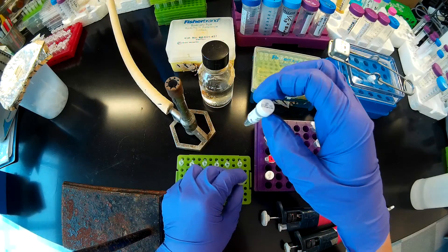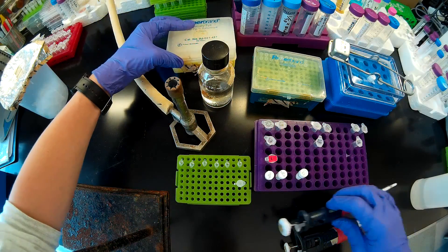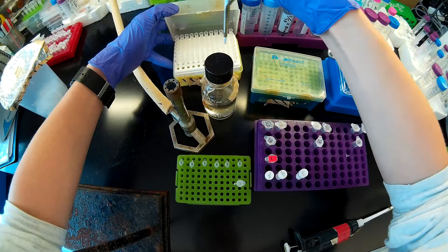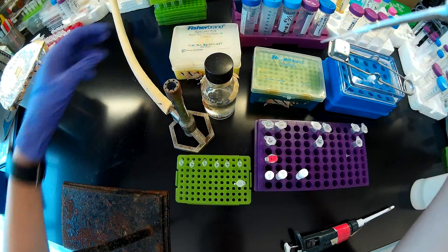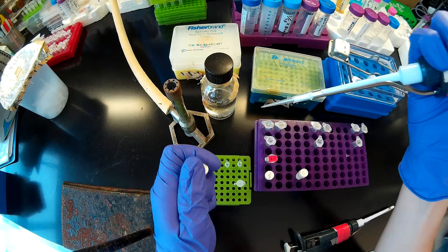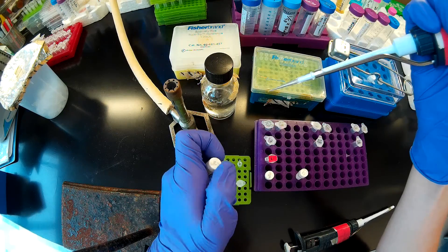I'm also going to add 62 microliters of the high GC enhancer because my amplicons have a GC content of about 80%. For guidelines on the use of the high GC enhancer, I would encourage you to refer to the NEB website.